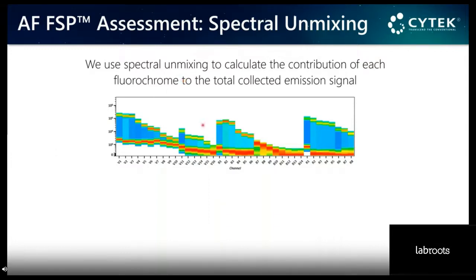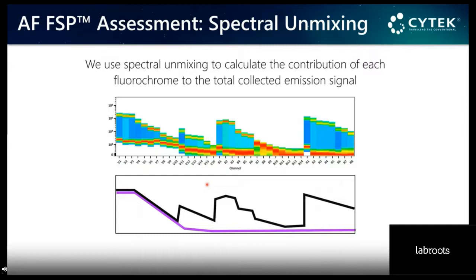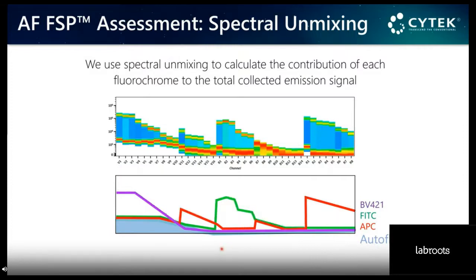This is how a multicolor sample will look. It's going to have multiple fluors in there, plus the autofluorescence. So the software, or the algorithm, is going to characterize how much light we're getting from the full sample and understand what components are there. For that, we use single color controls, one control per fluor. So we would use one for the violet dye, one for the blue dye, one for a red dye here, and also unstained cells to know how much intrinsic light is being produced in this system. Then the software is going to start extracting.